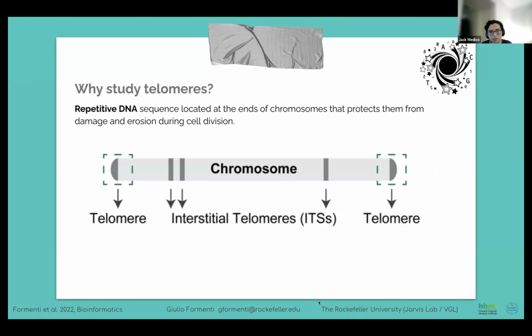So we saw the potential of exploring these regions not only because of the medical applications, but also because telomere length is being associated with several traits, longevity, etc. And also, having telomeres is a sign of a good assembly, right? If you have a very fragmented assembly, it's very unlikely that we'll have telomeres, especially if you have low coverage at the ends.